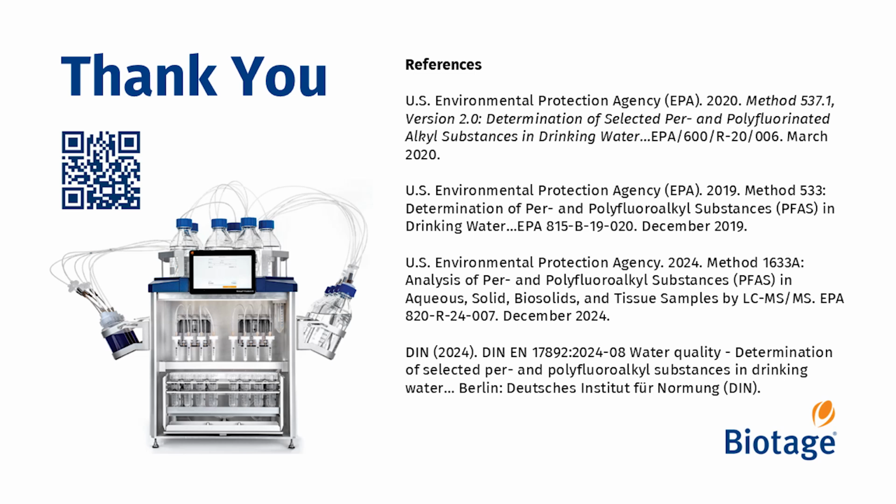Thanks, Evan. That's great. We'll take our next question, which is, does the blended wax GCB sorbent format meet the compliance requirements of EPA method 1633A? Yes, that's a great question. So 1633A is a performance-based method.